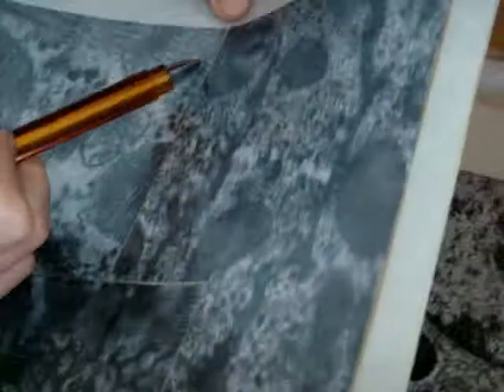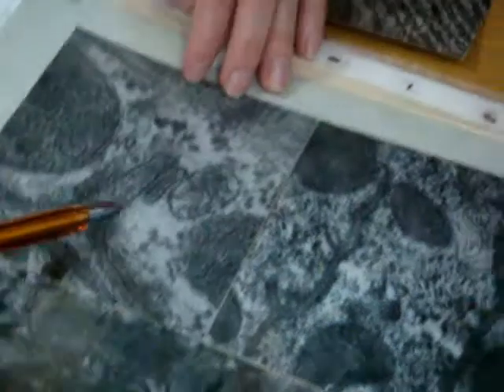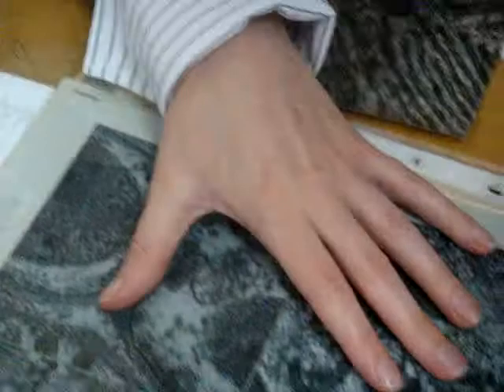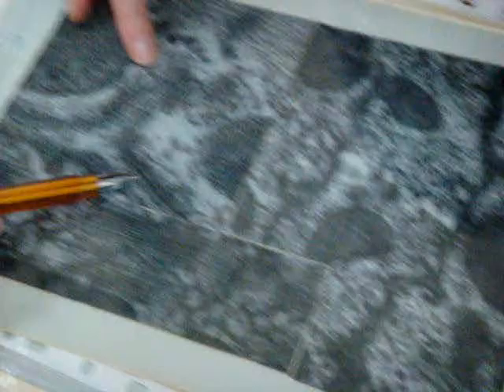This, look please, what is it? Striated muscle tissue, and this invagination is T-tubules. All these electron micrographs demonstrate T-tubules of striated muscle tissue. Look please, what are these T-tubules opposite, that line, so these electron micrographs correspond to cardiac. Here one T-tubule, one more, but we can't see opposite which structure. That's why we can't say exactly. This may be skeletal, maybe cardiac.